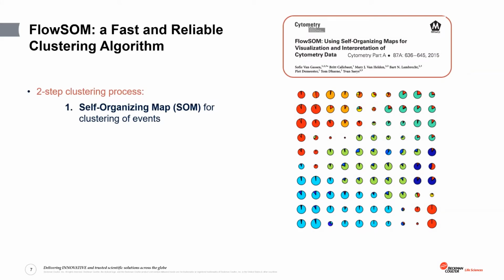All right, and another question, I'm just going to answer this one a little bit quickly because Steph has gone over it. Giovanni asked the question: if we do a time point analysis, so a longitudinal study, would the samples be equally sampled through viSNE so that you can track the changes in the metaclusters, i.e. changes in frequencies, expansion, and contraction? And the answer to that is yes. You would run them at the same time, and then you would apply the same SOMs on the actual samples. And if any of you have additional information, Steph, just correct me, or have I answered the question?